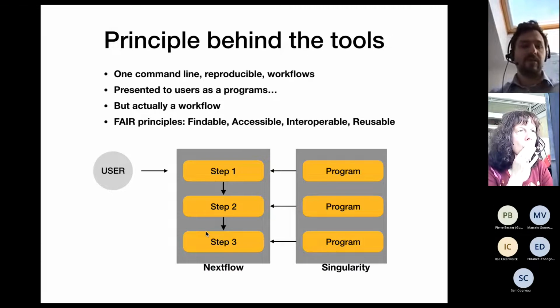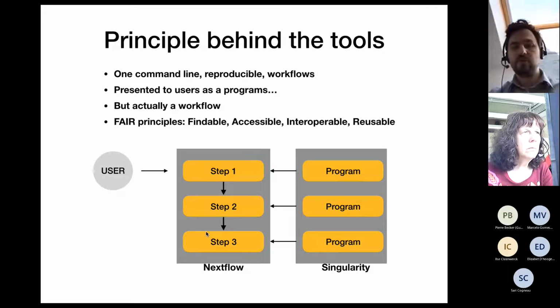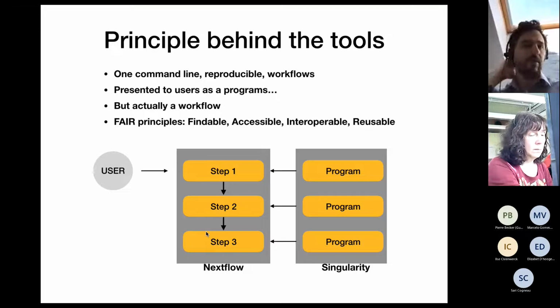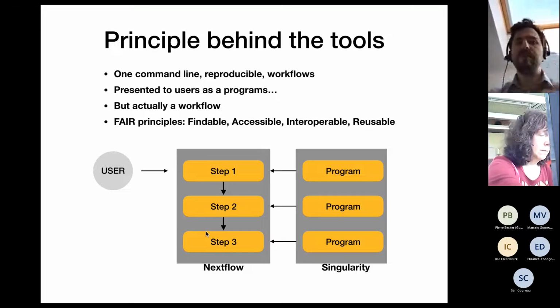I just said that the FAIR principles were the guidelines, and to respect that, I chose to run Nextflow and Singularity. I will explain first what Singularity is and then what Nextflow is, and you will better understand why it is FAIR.